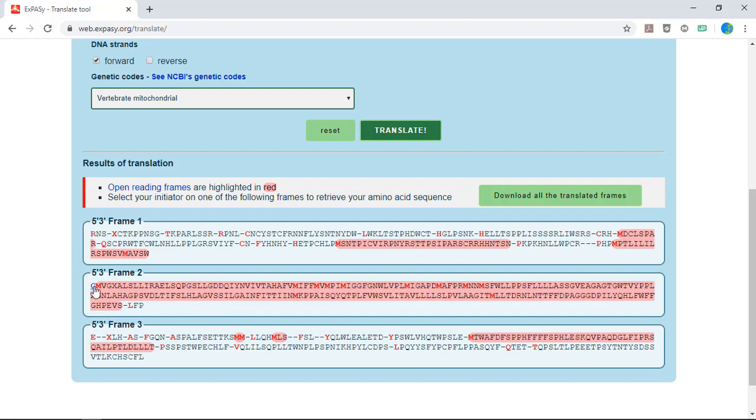Now click on the first one letter amino acid code in that correct reading frame and this should bring up your translated protein sequence in FASTA format.